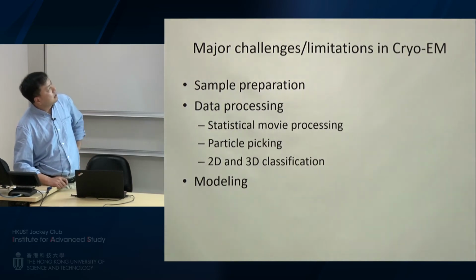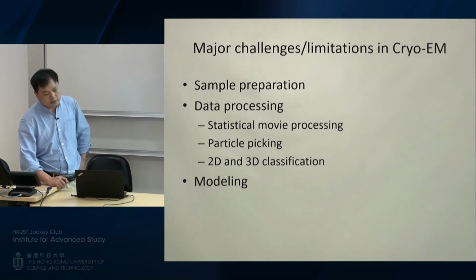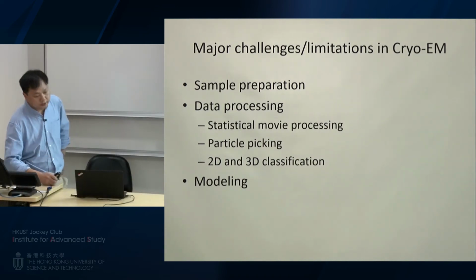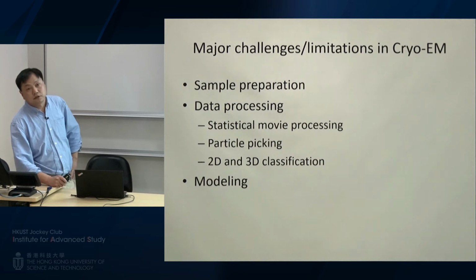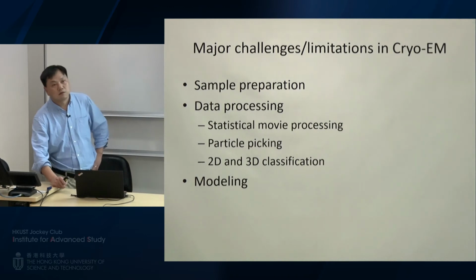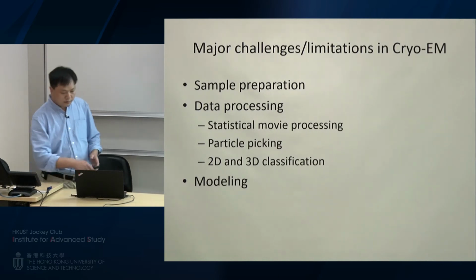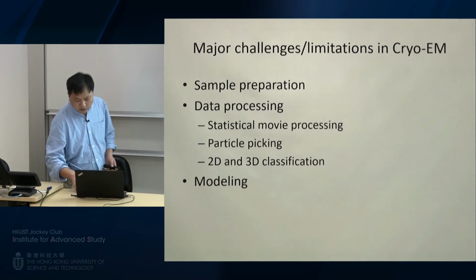Then, next, I will introduce a few major challenges and limitations in Cryo-EM. But of course, mostly it is from our experience. The first is sample preparation. Then next, I will introduce the current workflow of data processing and the problems in the current workflow. Another big issue is the modeling part: we will also need a new generation of software which can do automatic modeling from Cryo-EM into actual models.